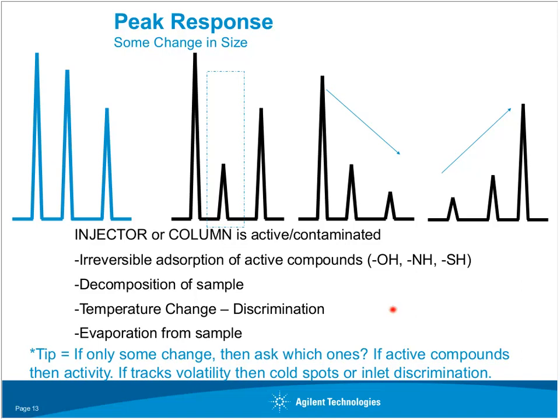The other thing I would add here is that some of the later eluting compounds, if they start to have problems with peak height, a lot of that could be due to either the flows not being properly set or, in some cases, the transfer line on the mass spec not being hot enough. So again, try to check everything.